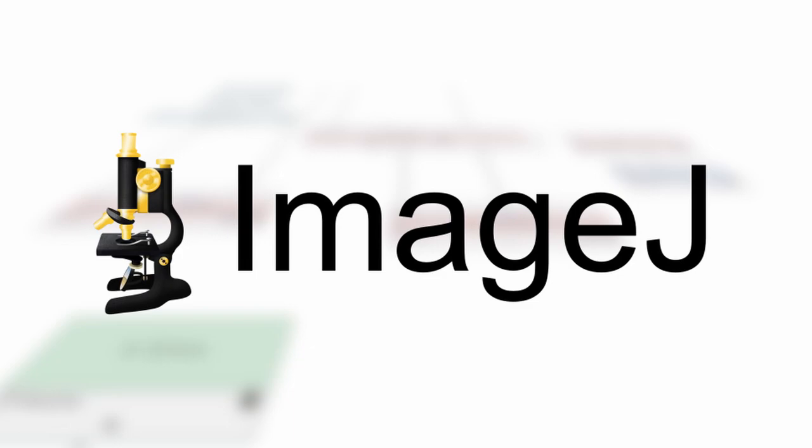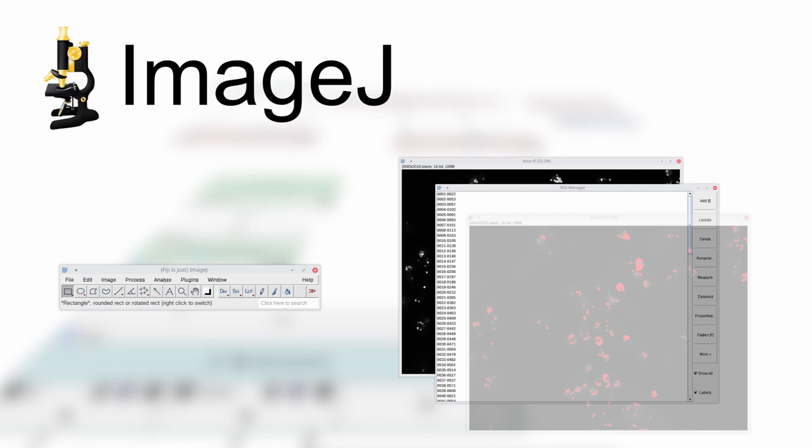Tools like ImageJ aid in the processing of such images by providing an easy-to-learn graphical user interface for tools like image filters, extracting measurements, and visualization.